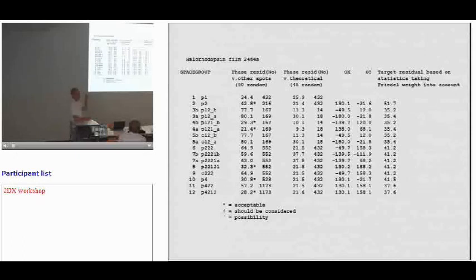So what Allspace does is take that value of IQ, or the signal-to-noise, and calculate what the phase residual ought to be if you've done everything correctly, if you've done beam tilt, CTF correction, and so on, and you've got the space group symmetry right. It tells you what it ought to be, and it then compares that with what it is when you assume particular space groups.